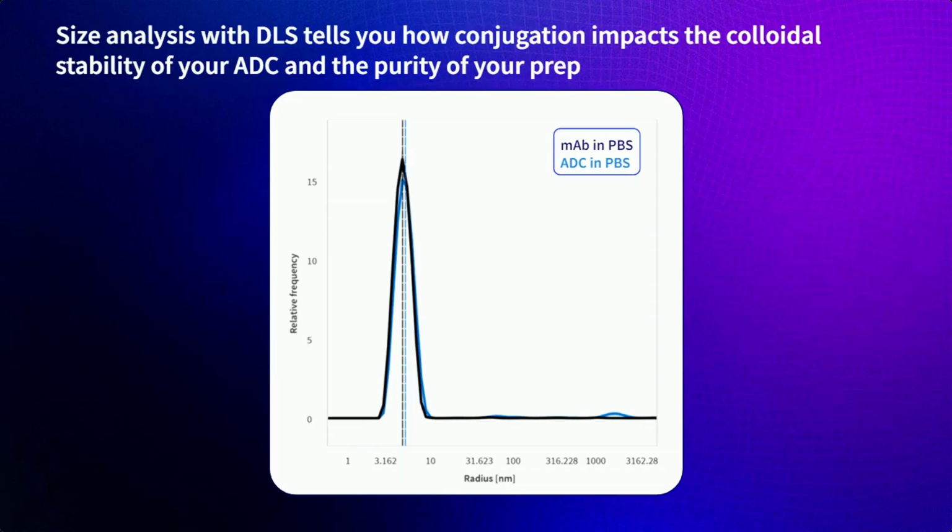Isothermal DLS measurements are really critical for determining whether there are contaminants, unconjugated drug, or aggregates in your sample. These measurements are a reflection of how your biologics are behaving on the bench. So shown here is a measurement that was performed at 25 degrees C before the thermal denaturation gradient we previously saw. So this is data derived from size analysis with DLS, which informs on the size of molecules you've got in solution, as well as the distribution of particle sizes.